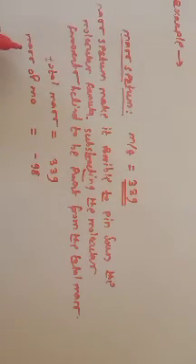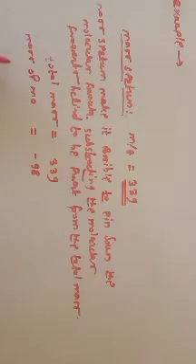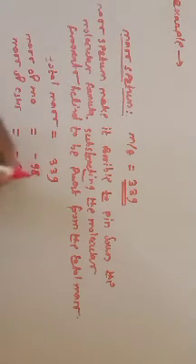All these fragments are subtracted from 339. Again, the mass of C5H5 is equal to 65, so we subtract that from 339 as well.